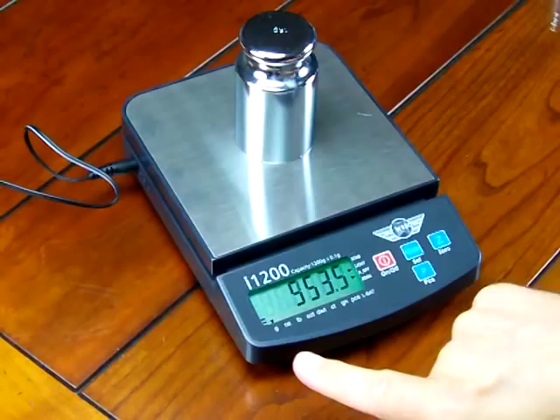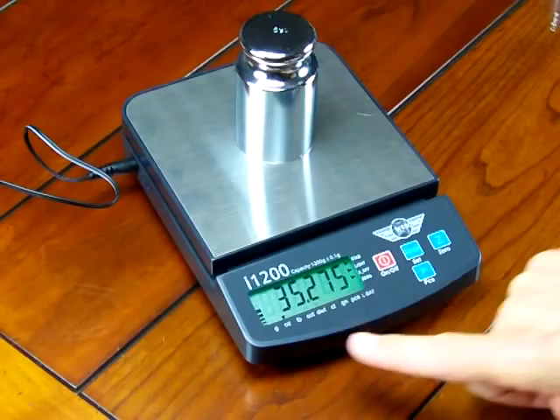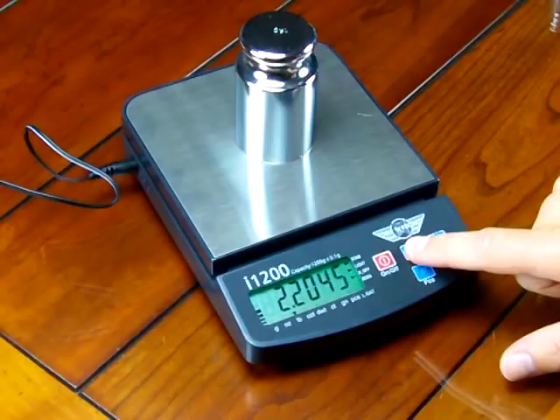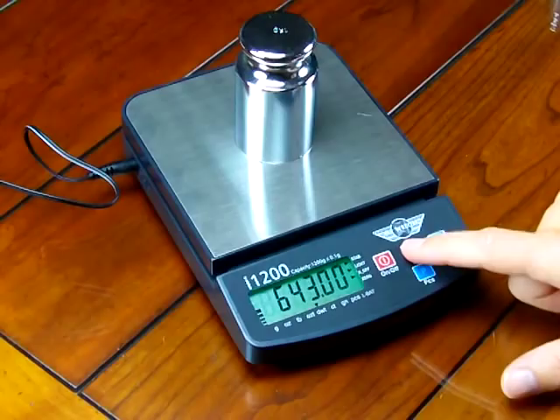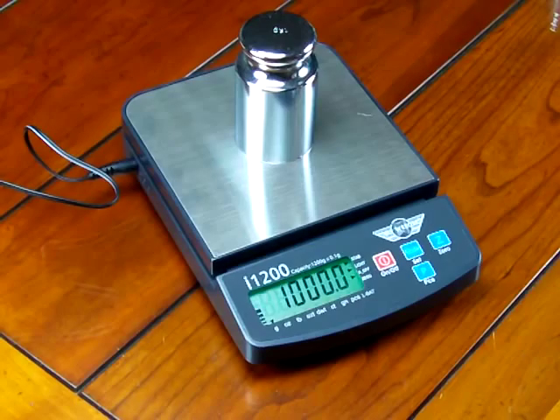A few more features I'd like to show you: we can choose multiple weigh modes. Right now we're in grams. We can change the weigh mode by simply pressing the mode key — we go to ounces, then pounds, then troy ounces, penny weight, carats, grains, and there's also a parts counting feature. Then we're back to grams.